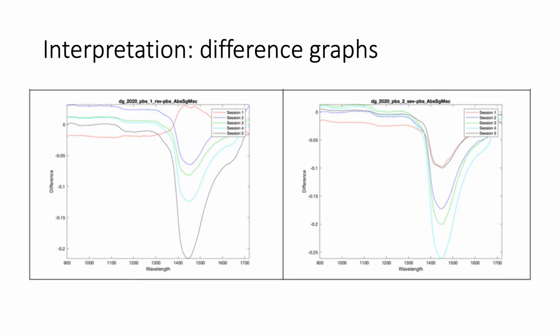Data measurement was done using the measurement system on the left. Here we have an NIR spectrometer, a light source, a computer, a probe, and the sample holder. The sample holder has a glass slide, a sample well on the glass slide, and a reflectance standard, so that the measure is relative to this standard.